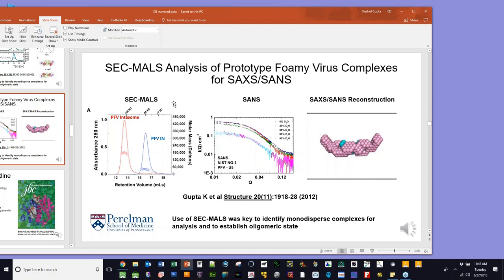Cool. Okay. So the next question for you, can glycosylation patterns or unstructured parts of proteins be identified or differentiated using MALS? I believe so. I think you have to look for certain things. The biggest telltale for an unfolded protein is simply the retention time. And this ends up being one of the most confusing issues in gel filtration. You see a peak that's consistent with a dimer, but when you do the MALS analysis, it's actually an extended monomer. Likewise, unfolded proteins will have very short retention times versus their folded globular counterparts. So that combined with the MALS analysis is a very strong approach to really nailing down the unfolded character of an extended polymer, unfolded polymer in solution.